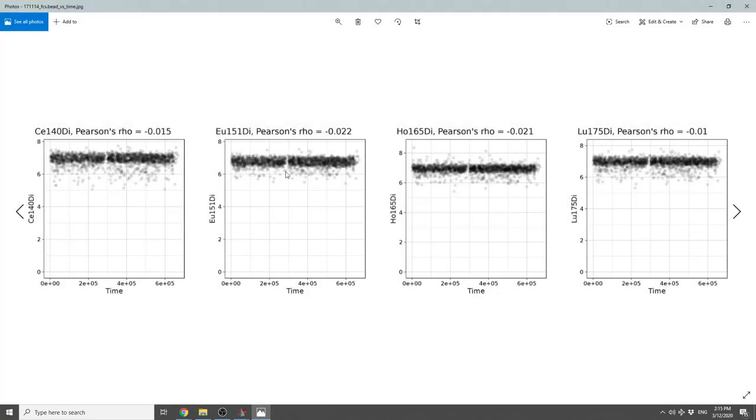Next, it's going to show us the expression of the beads over time. So this is a great metric to make sure that the data was normalized correctly versus the beads, and that there's no weird trends there.